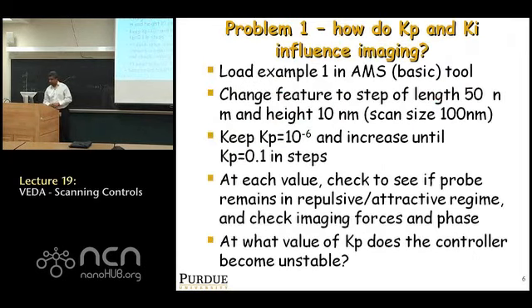So here's an example, and the next class you're going to do VEDA simulations, and I encourage you for the Tuesday class to bring your laptops. It's going to be a VEDA of scanning now, and you're going to learn about how you create a surface in VEDA, give properties to it, approach a sample, scan, change. You can literally scan in VEDA. It's really nice. And see how these properties influence the image.